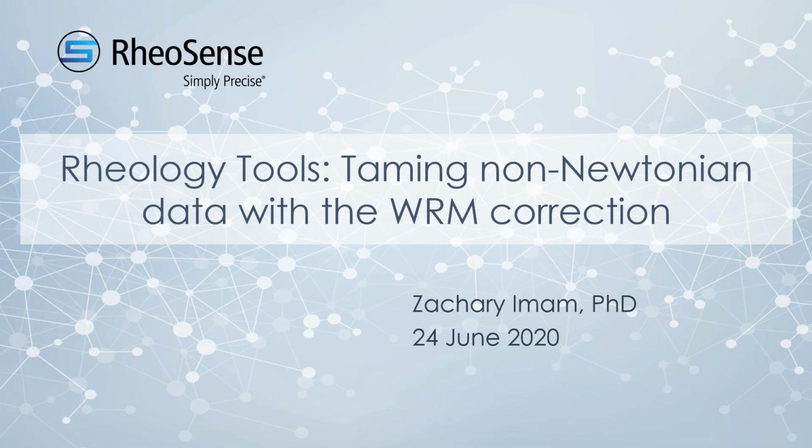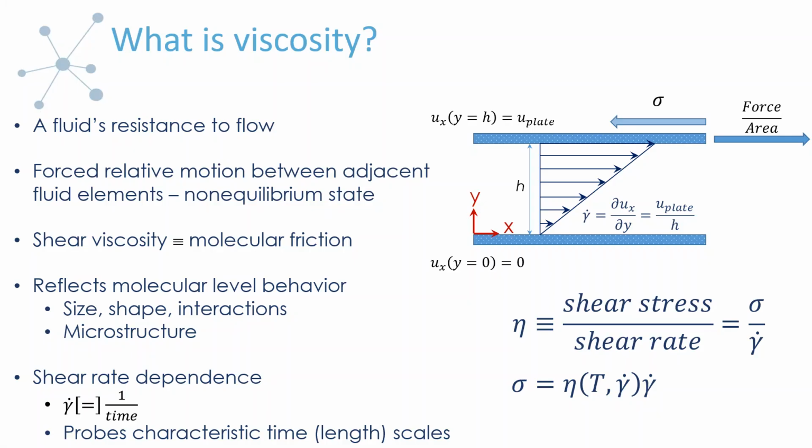And today I'll be adding some tools to your rheology toolbox on how to tame your non-Newtonian data with the Weissenberg-Rabinovich-Mooney correction, or WRM correction for short. So first off, we'll just answer a commonly asked question, which is what exactly is viscosity?